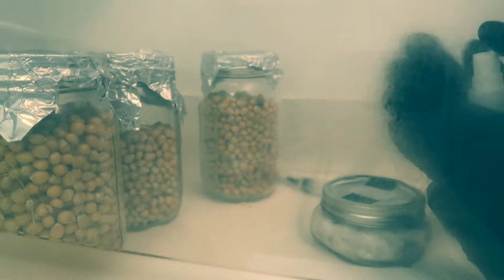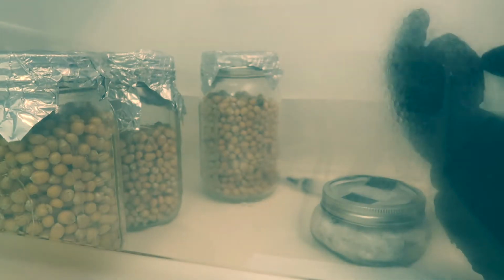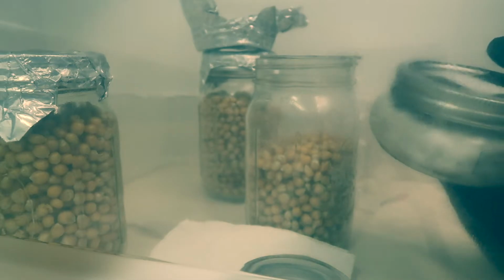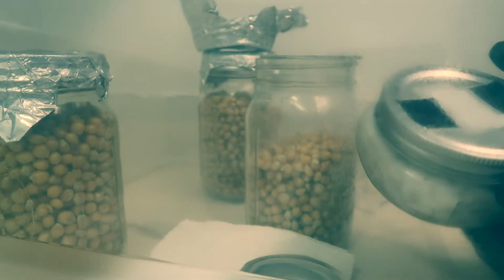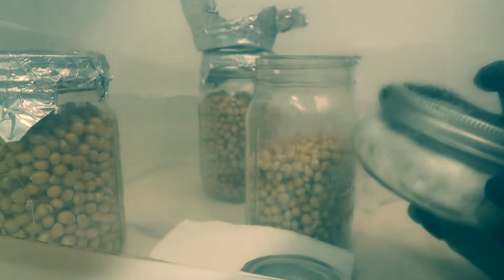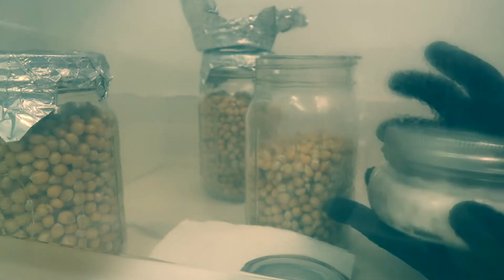I'm just doing a light little spray down of isopropyl in between everything. Now this grain jar is so small I could have taken the time to break it up and shake it up and everything, but since my hands have been sanitized pretty well and I'm in a pretty sanitary still air environment, I'm going to go ahead and just use my finger to break up some of the grain on top and dump it into this jar right here.